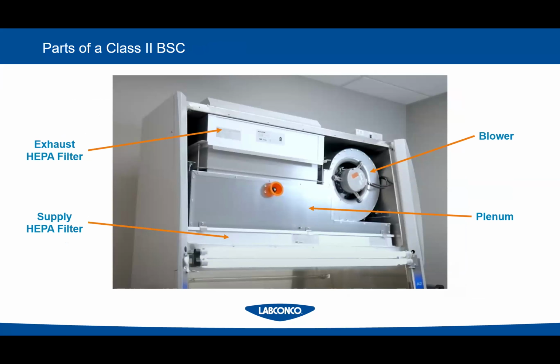We've got cabinets out there, I like to say, that are old enough to drink. They're over 20 years old. You have no idea what could be in those filters or cabinets over the last 20 years, right? So you always want to call in a certifier, have those hoods decontaminated before any work is done on the internal plenum components of that. Very important.